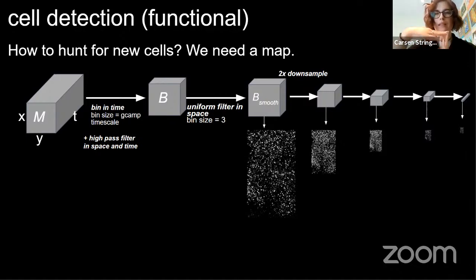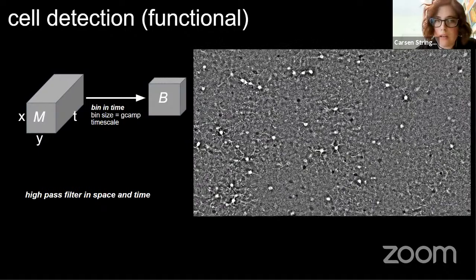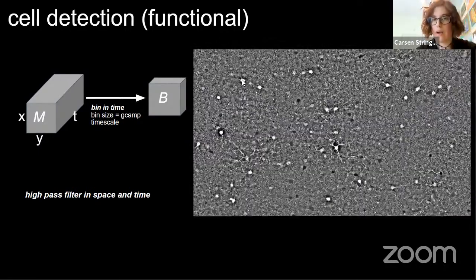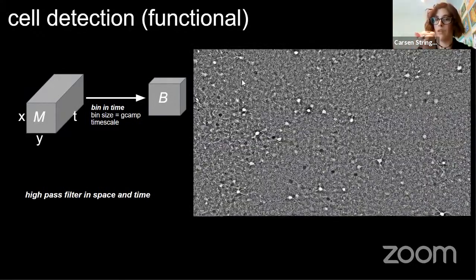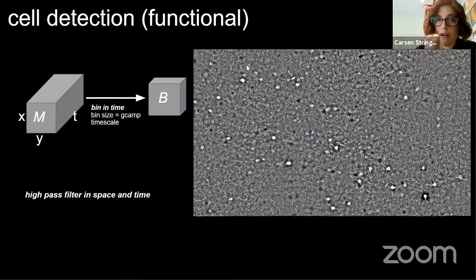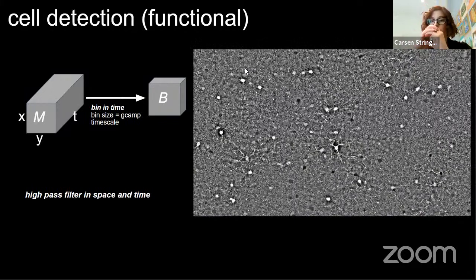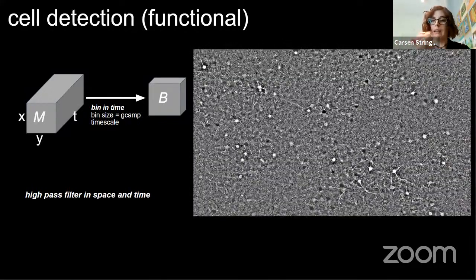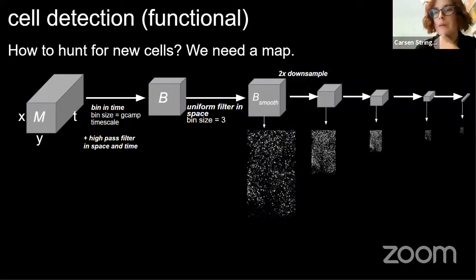I don't know if I'm explaining this the best way, but if you have pixels here that are correlated to each other, and you sum up this square, it'll still have a high dot there in a max across time. But if I sum up a square of pixels that are just noise, it'll just be 0. So you start growing out how much you downsample, and you can find things that are correlated of certain sizes. That's how this downsampling step works. Maybe I should have another animation here. I'm sorry, it's not super clear.